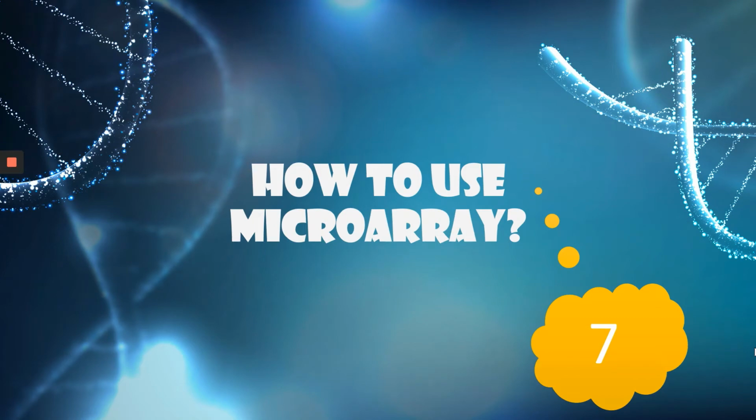So there are actually 7 steps, which I already minus the ones to create a microarray glass plate, because I have bought one to help us with this experiment. So 7 steps will be needed to do a microarray.